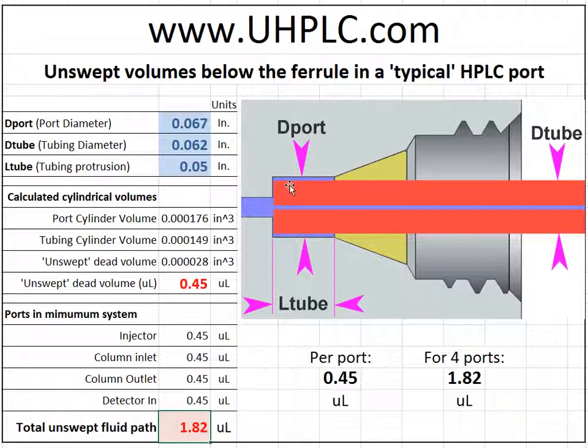Now, how significant they are with respect to the types of flow here and the amount of sample carryover that can be seen is beyond the expertise of this particular commentator, and certainly temperature, viscosity, and flow rate dependent. So we'll conclude now.